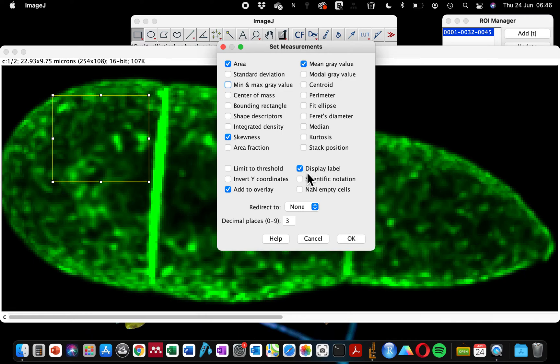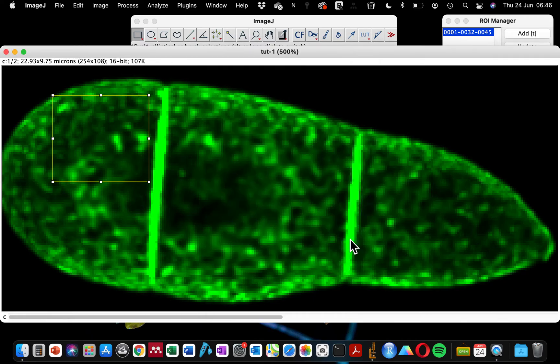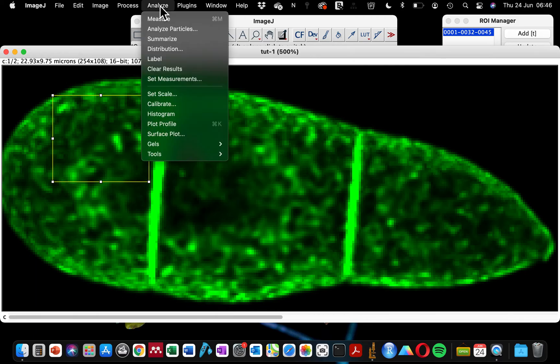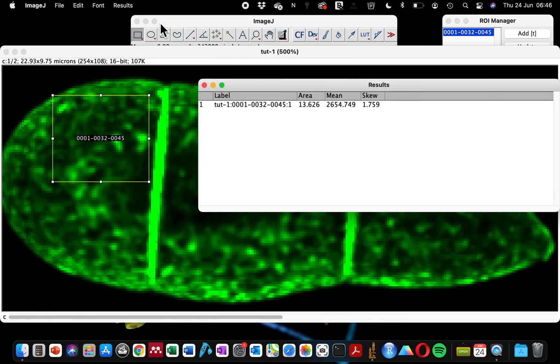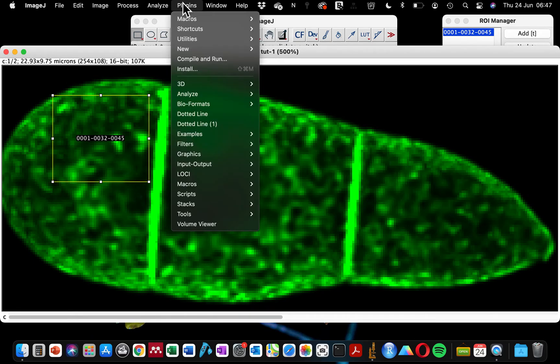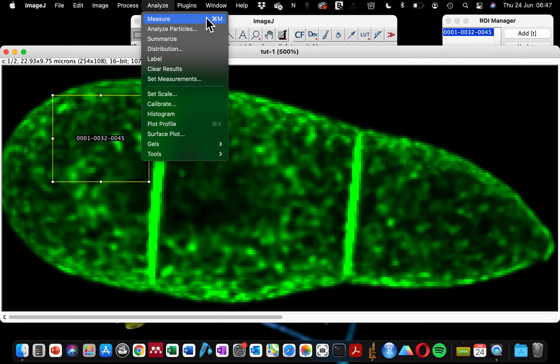Now you can click OK because you've selected the type of measurement you want for your analysis. The next thing is to go to Analyze and click on Measure. You can also use the shortcut — Command+M or Control+M — to get that measurement.